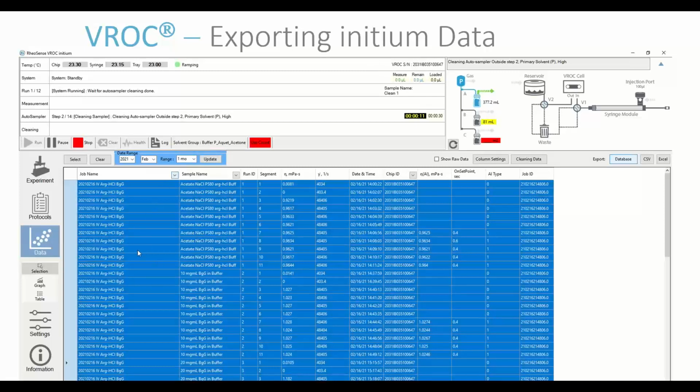So for this particular application, it's an arginine hydrochloride formulation with bovine gamma globulin. You click on the left here to highlight the data that you want. And if you want to click on multiple data sets, you hold the control button, similar to when you want to open multiple files on your computer.